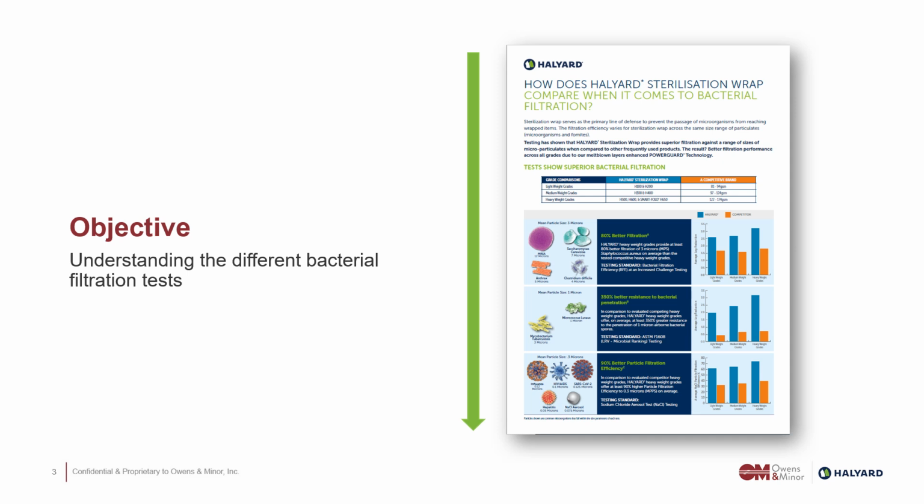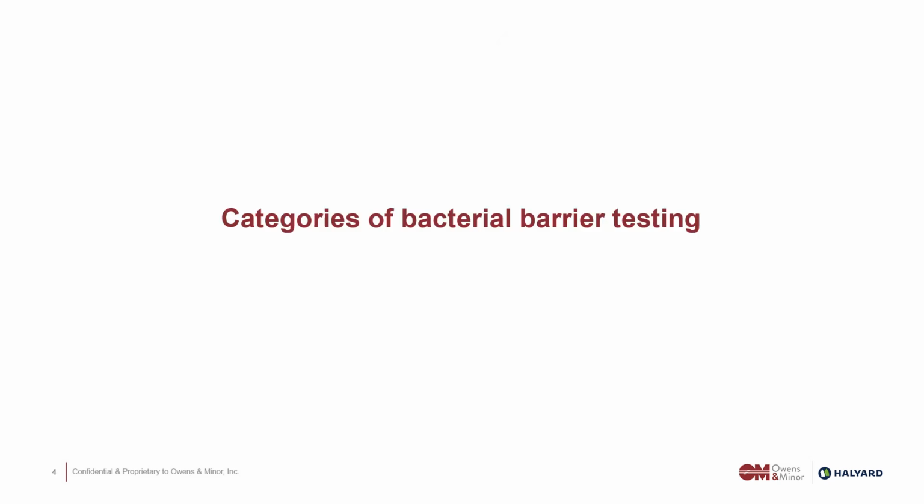In the testing, we're going to go from larger particles, being a stock standard Staphylococcus aureus of 3 micron, to smaller particles of 0.3 micron, which is a salt particle. So these are not the usual tests that we talk about, hence this training.